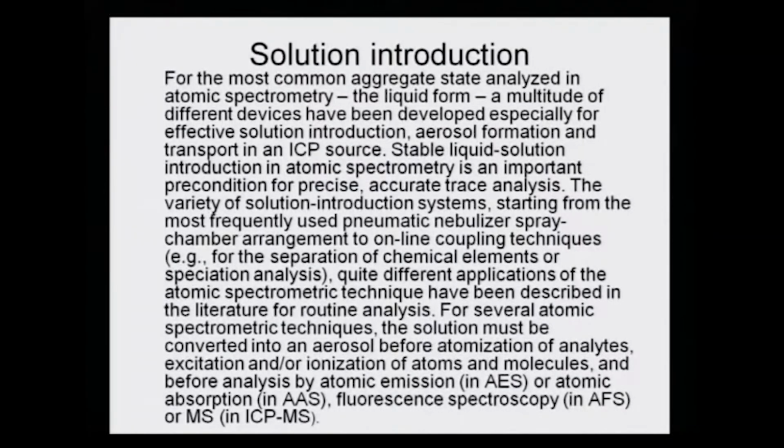For the most common aggregate state analyzed in atomic spectrometry, the liquid form, a multitude of different devices have been developed, especially for effective solution introduction, aerosol formation and transport in an ICP source. So, there are three different issues that need to be understood. How the solution is being introduced, that means whether a peristaltic pump or a pneumatic pump is being used, and so on. Then how the aerosol, or the mist of the standard or sample solution, is being formed, and how it is getting transported in that ICP source.